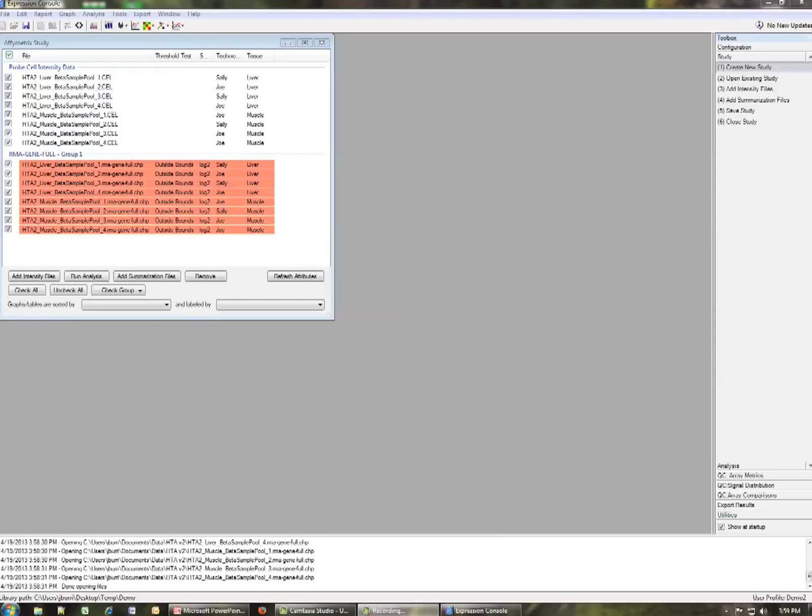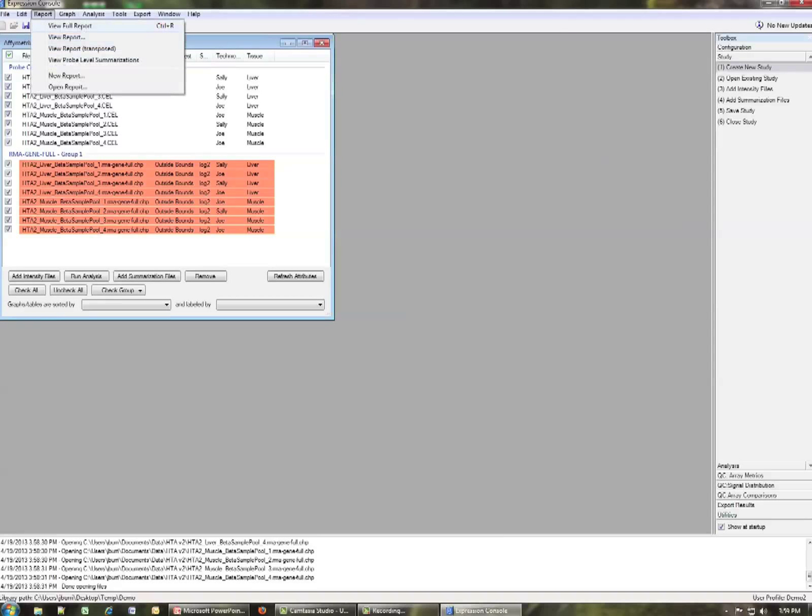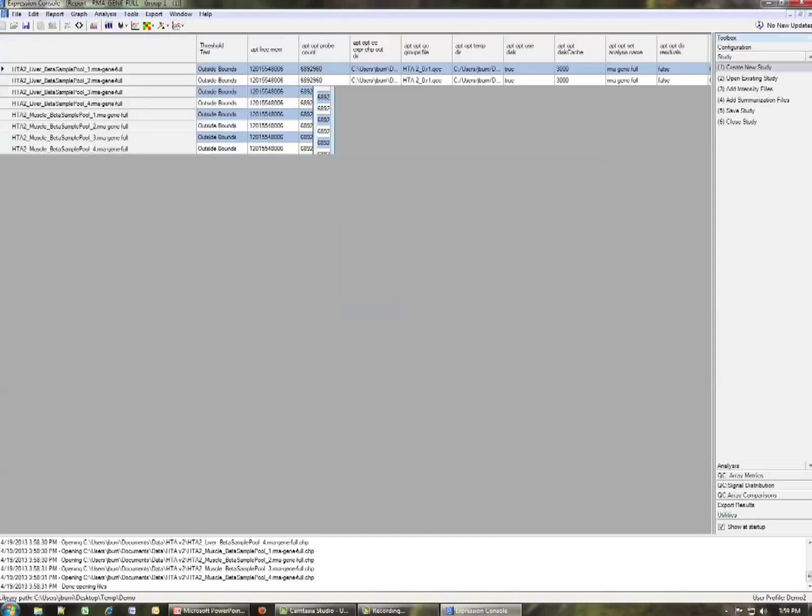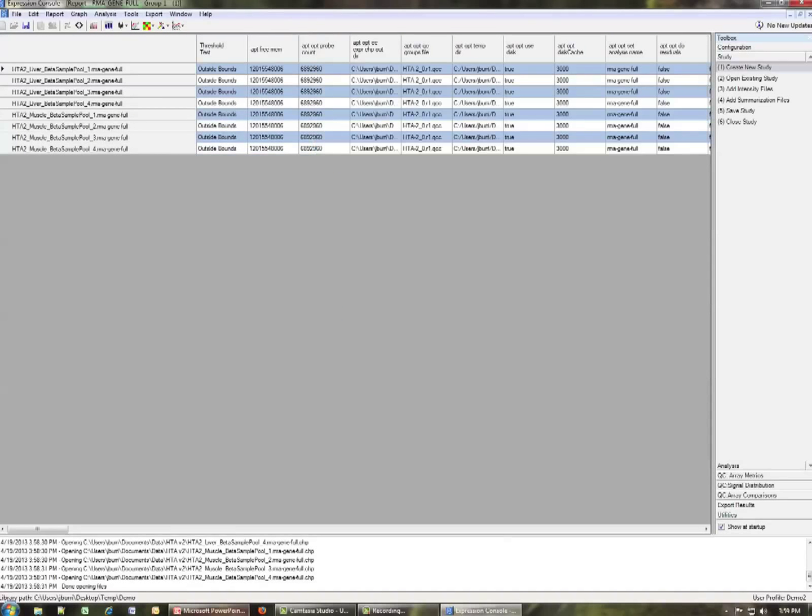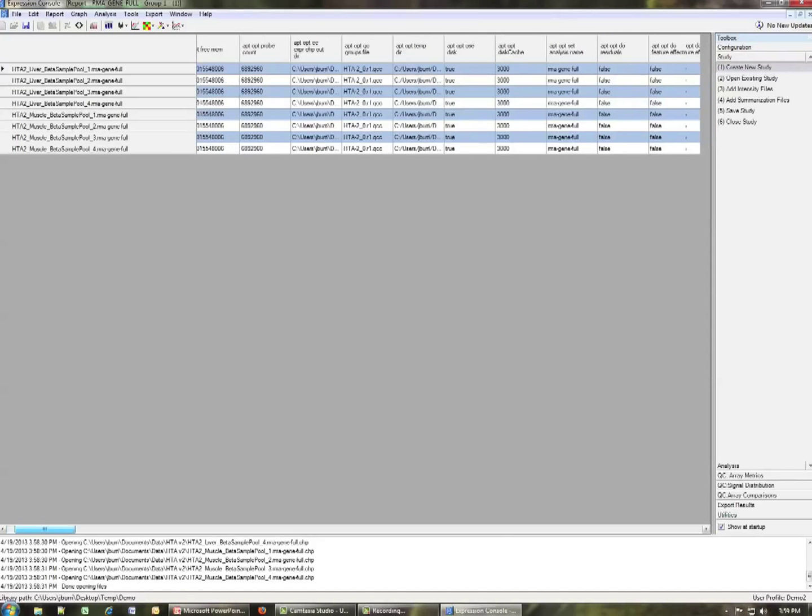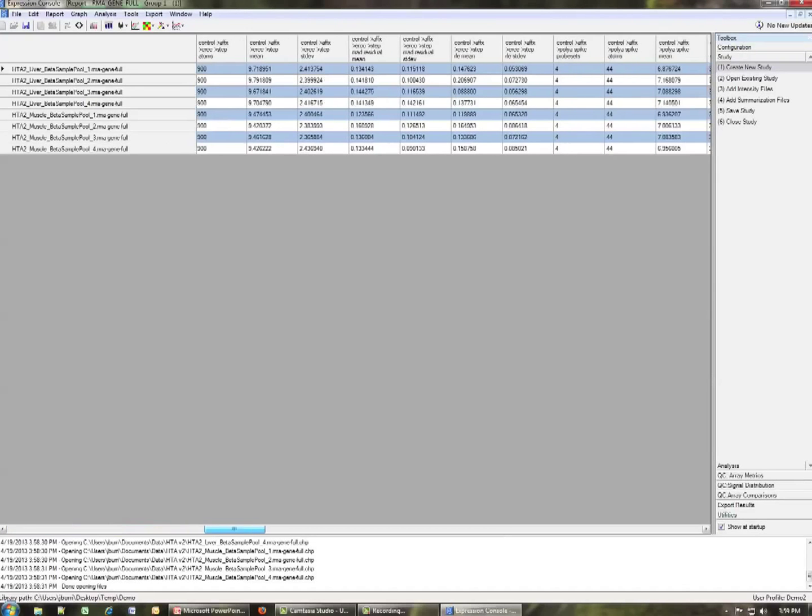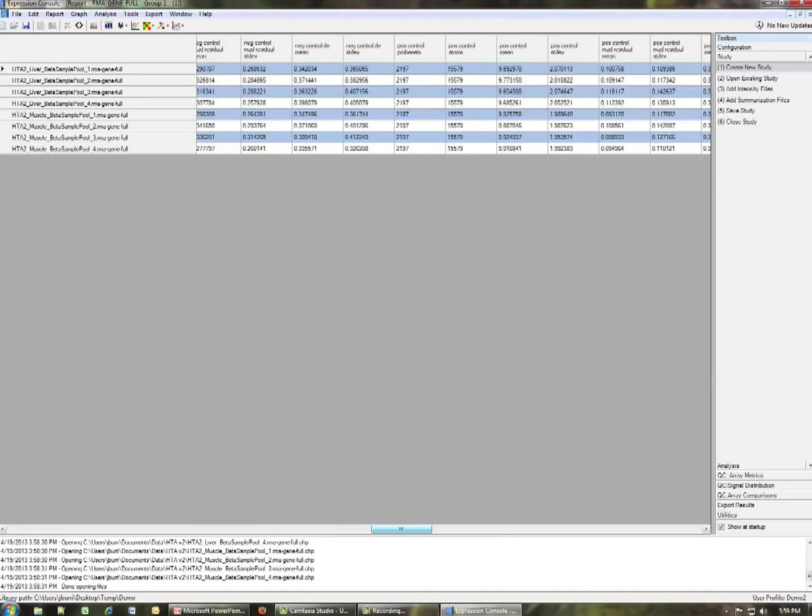So by default, as reviewed in the QC video, if you go to the report section and open a full report, you're going to see a report that has many columns of information, some of which may not be that relevant or of interest to you. So here you can see there's lots and lots of columns of data associated with it.